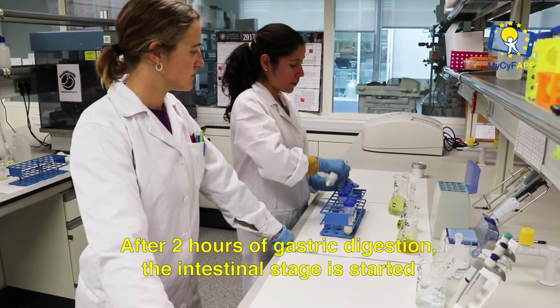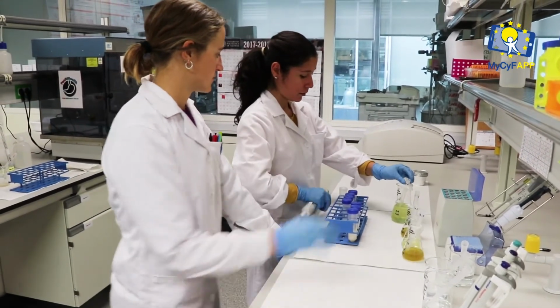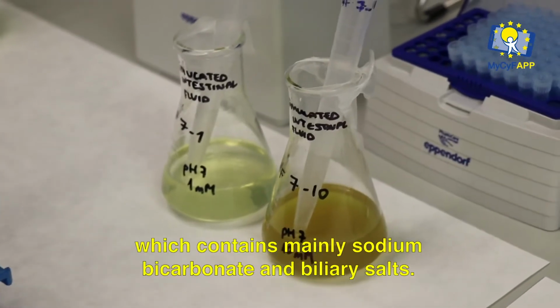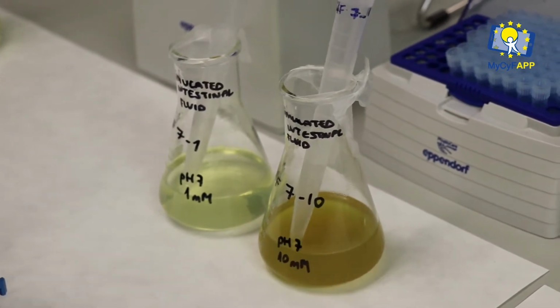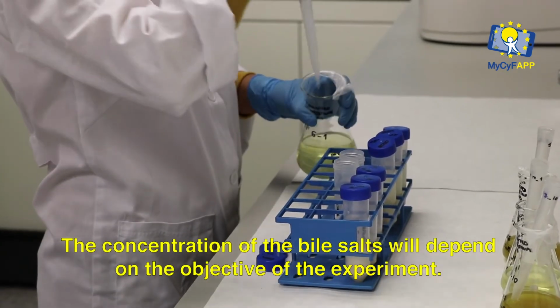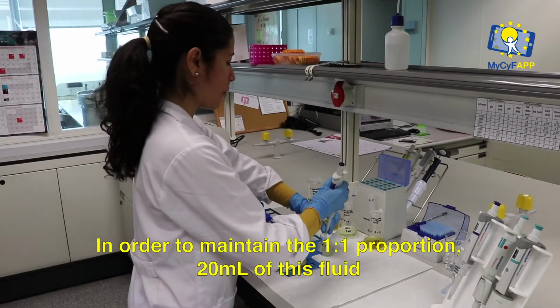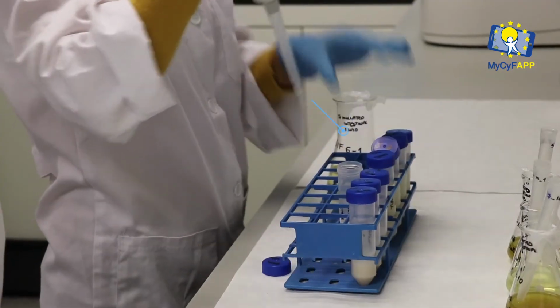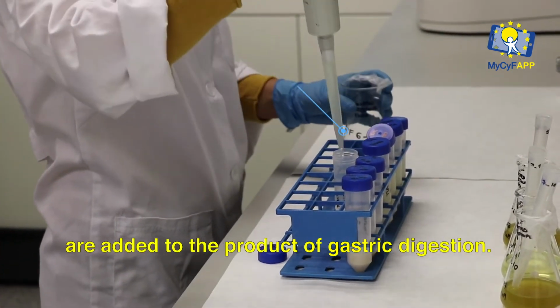After 2 hours of gastric digestion, the intestinal stage is started by the addition of the simulated intestinal fluid, which contains mainly sodium bicarbonate and biliary salts. The concentration of the bile salts will depend on the objective of the experiment. In order to maintain the 1:1 proportion, 20 milliliters of this fluid is added to the product of gastric digestion.